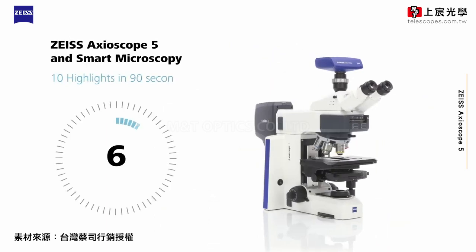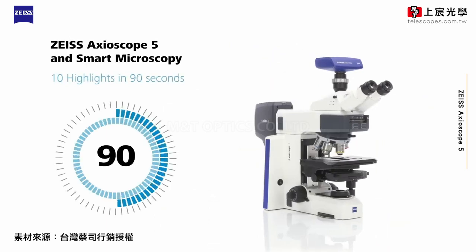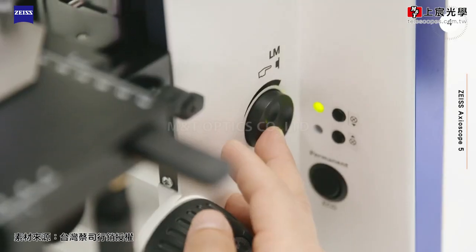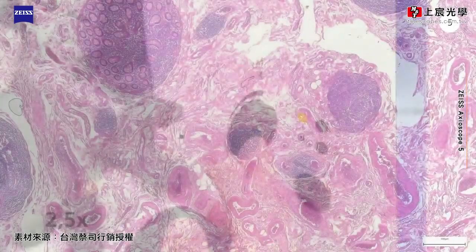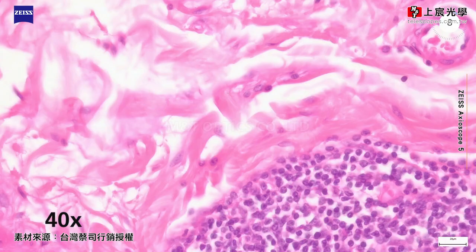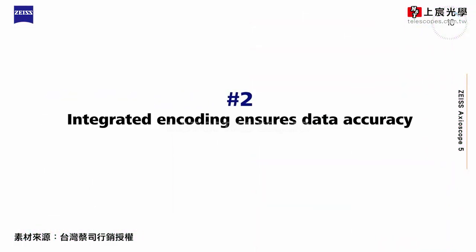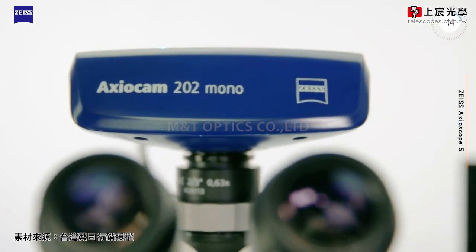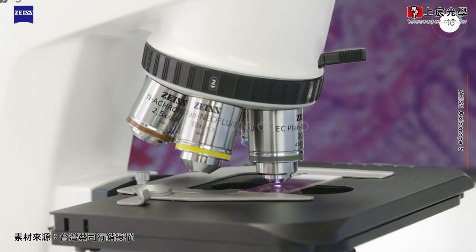Zeiss Axioscope 5 and smart microscopy: 10 highlights in 90 seconds. The light manager memorizes the individually set light intensity per objective and provides uniform brightness at all magnifications. Axioscope 5 offers integrated encoding of nosepiece, reflector turret, and LED light sources.